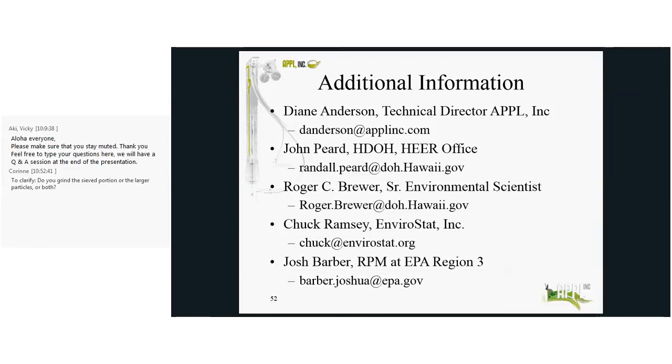So Diane, this is Roger again. How often do you see RSDs over 50%? That's the level where we really start to be more concerned from a risk standpoint. Is that very common? No, that's not. We don't see them there very often. We're more likely to see them over 50% in a field duplicate than in a field triplicate than in a laboratory triplicate.